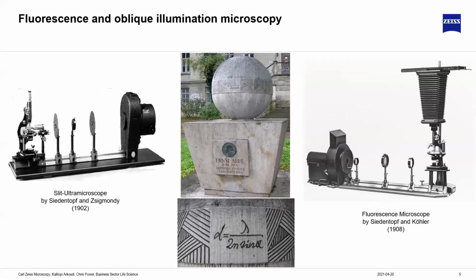Now, whilst working on the contrast on this prototype microscope, people began to think about the resolution side. And we worked for Carl Zeiss. One of our co-founders was a gentleman called Ernst Abbe, whose memorial in Jena is the picture in the middle. One of the things he did extremely well was to work on the theory of optics, turning it from the trial and error designs of the early 1800s into the scientific basis we have today.